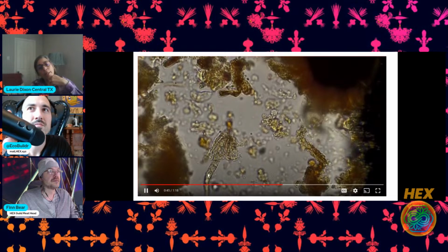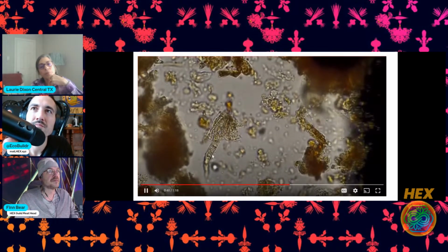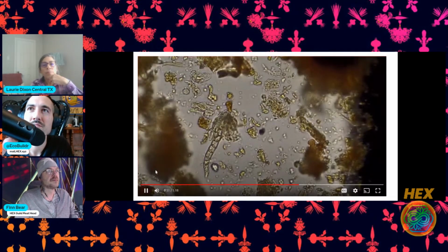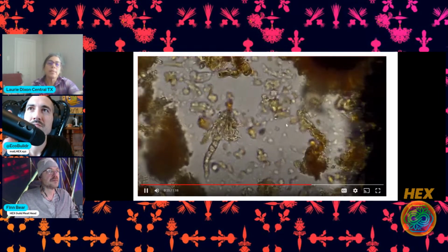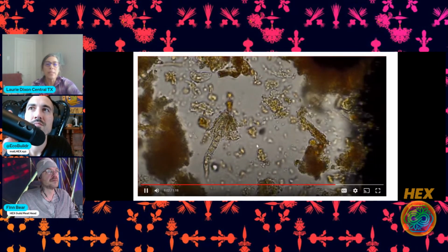This is probably a microarthropod right here. It's a squished dead something right here. And these are all those beautiful aggregates that we're looking for. When we're looking at a sample, when we see something like this, it's like, oh, I might be at this for 2 hours because there's so much to look at. They're so fun to watch their movements.